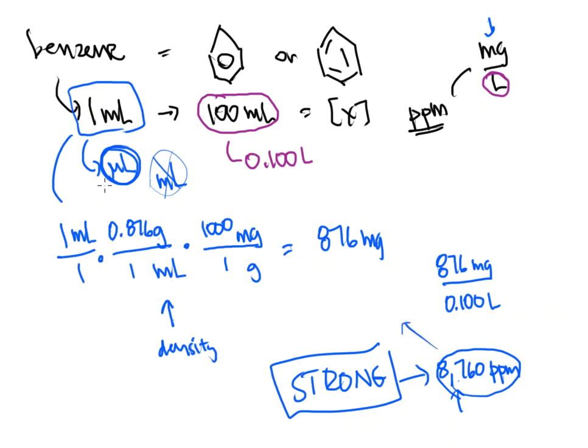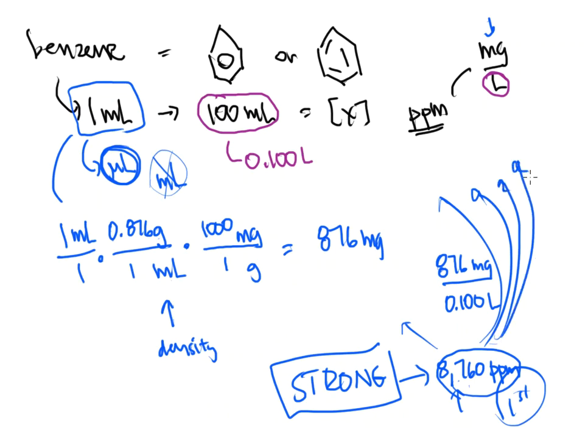Now, what if we don't have microliter technology? Well, the answer to that would be you would have to make this one first. And from this one, you would then dilute down the rest of them that you would need to end up making. So take 1 milliliter of that substance and dilute it down again. Take a half mL of that substance, dilute it down again. Whatever you need in order to do your job, and get it to the parts per million level that's acceptable on the GC, then that's what you've got to do.